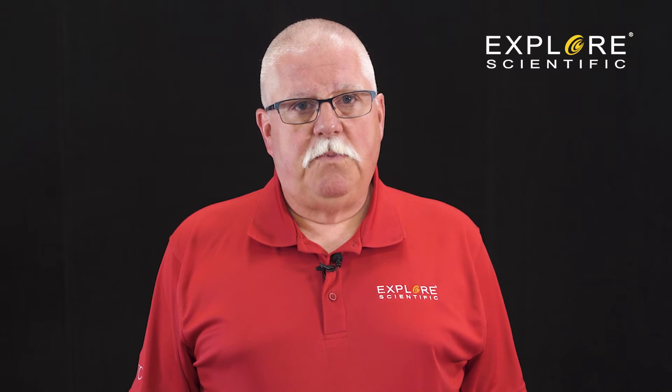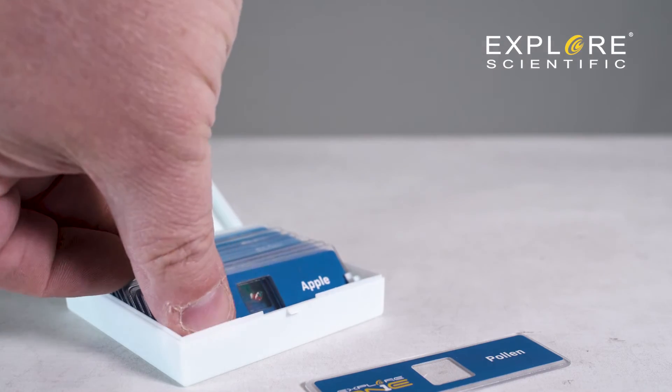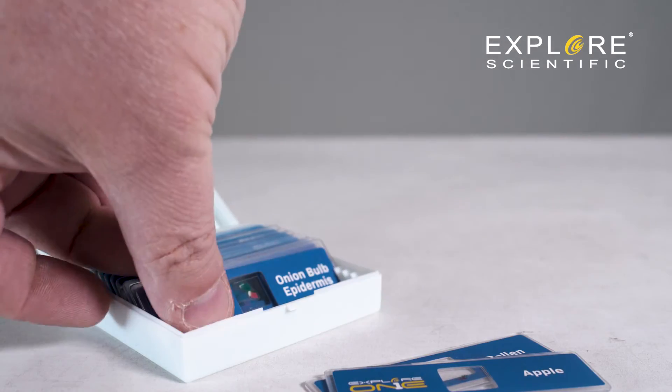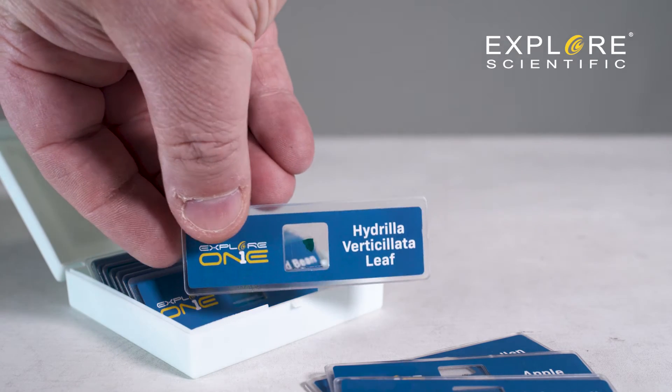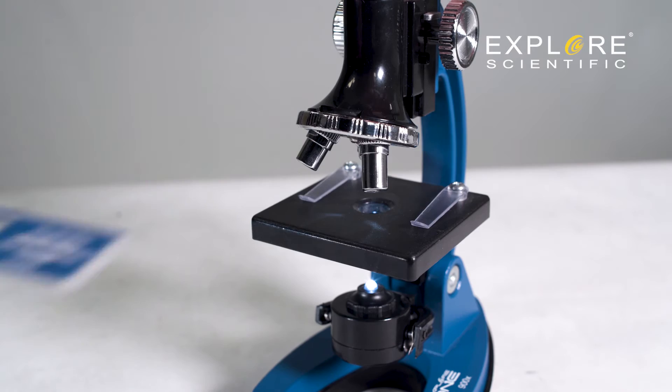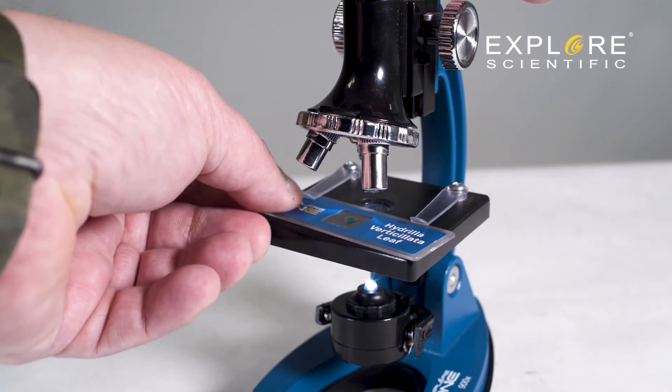Let's pick a specimen. In this case, because we're just starting to learn how to use the microscope, choose a specimen that is dark.